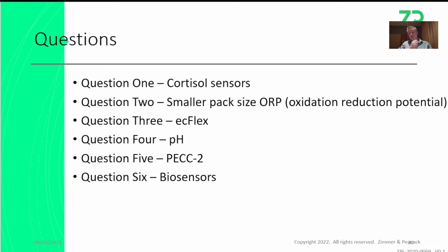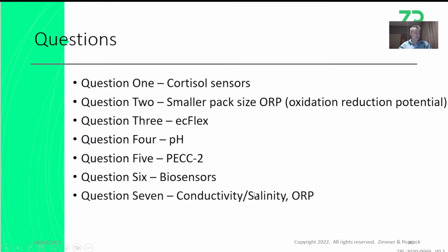In terms of biosensors, we talked about cross sensitivity between sodium, potassium, and ammonium. And I've also said that all of our sensors are designed to be used in continuous mode. It's just that if you're going to do something like a bioreaction, these things can go from 3 to 10 days, at which time sensors can drift. So you sometimes have to build in a strategy for bringing in calibration solutions. If you can do that, it forgives a lot of things like sensitivity changes and drift.